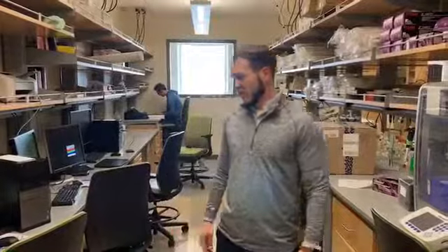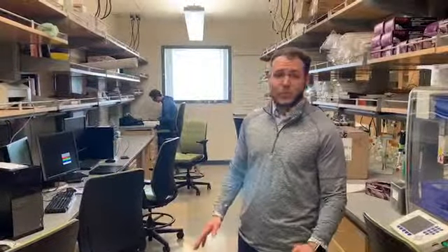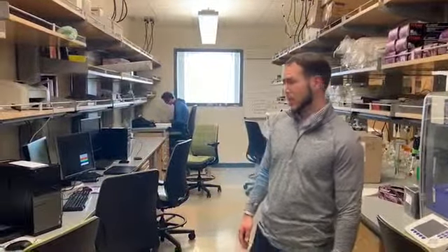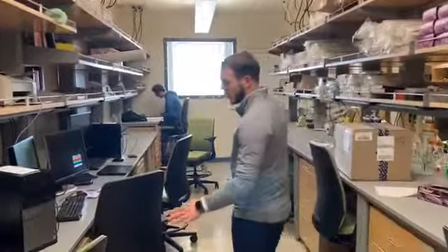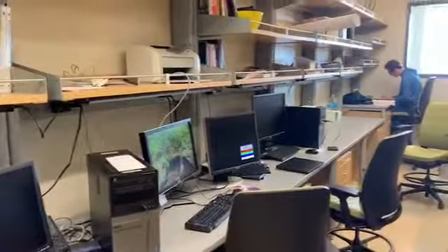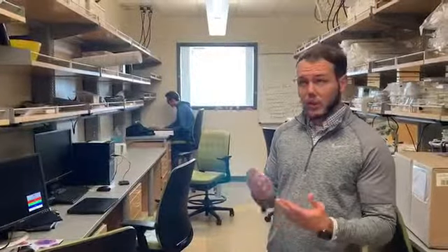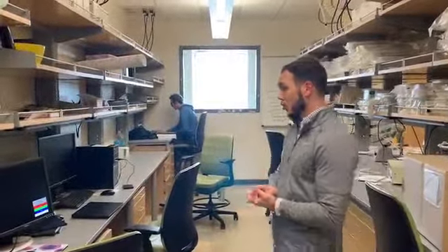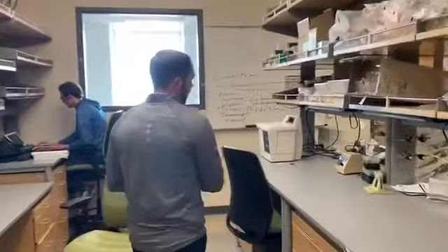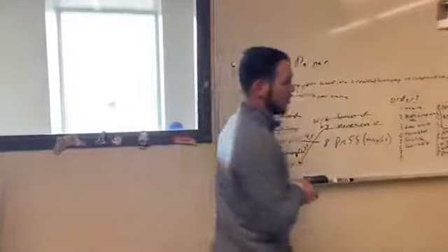We're going to take you through a tour of the Hansen lab in the PDBIO department. Our lab focuses primarily on novel drug discovery projects and pharmaceutical research. One of the approaches we take is using computer models to simulate in silico docking with protein crystal structures and molecular binding interactions. Other things we do in our lab are cellular-based assays, enzymatic-based assays, as well as Western blots.